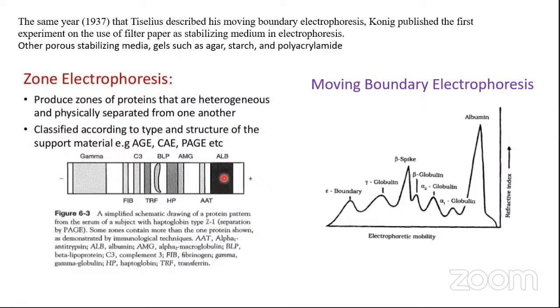So will it not prevail as the force of migration? Albumin will try to migrate in both directions, because the movement of albumin will be from its region of higher concentration to its region of low concentration, right? The same is true for this AAT molecule, and the same is true for everyone.